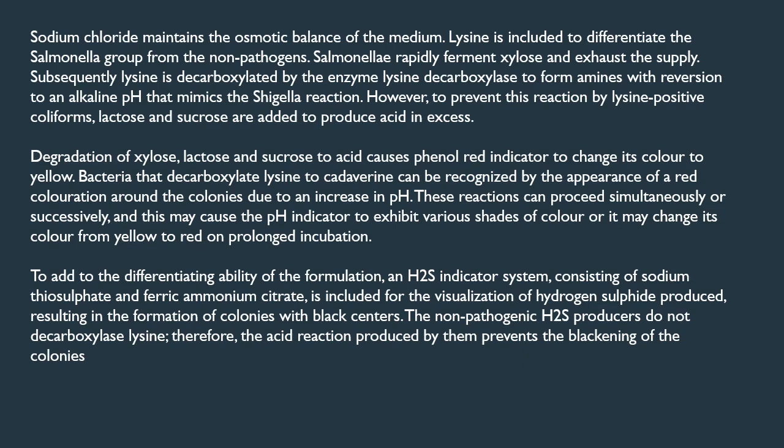The non-pathogenic H2S producers do not decarboxylate lysine, and therefore the acid reaction produced by them prevents the blackening of the colonies. So those which are non-pathogenic and non H2S producers will have no black colonies. But the Salmonella species will show black colonies on XLD agar.